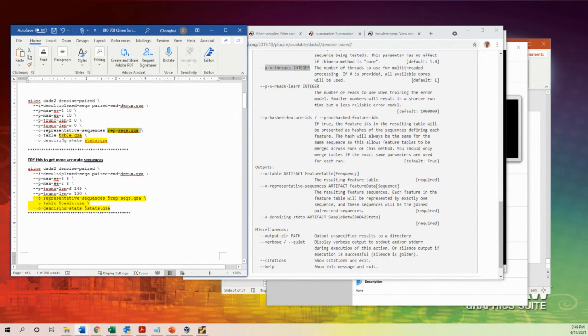And the table is basically the sequence frequency. Once you get the taxonomy classification, you combine these and then you can perform alpha diversity, beta diversity, correlation analysis, all kinds of analysis. That's why this is the most important step at this stage. So I want you to create these 3 different files.